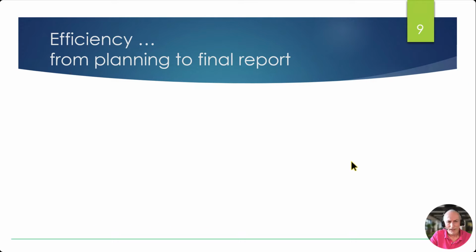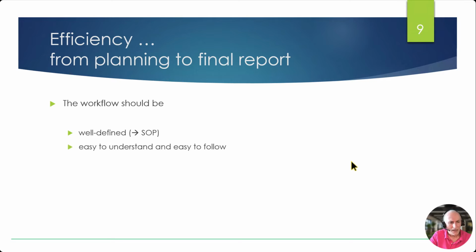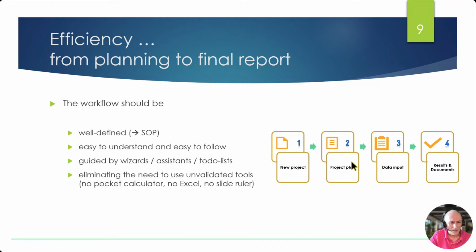Efficiency from planning to final report. The workflow should be well defined. This should be handled in your SOP documents. Easy to understand and easy to follow. Guided by wizards, assistants, to-do lists. Eliminating the need to use unvalidated tools. So no pocket calculator, no Excel, no slide rule.